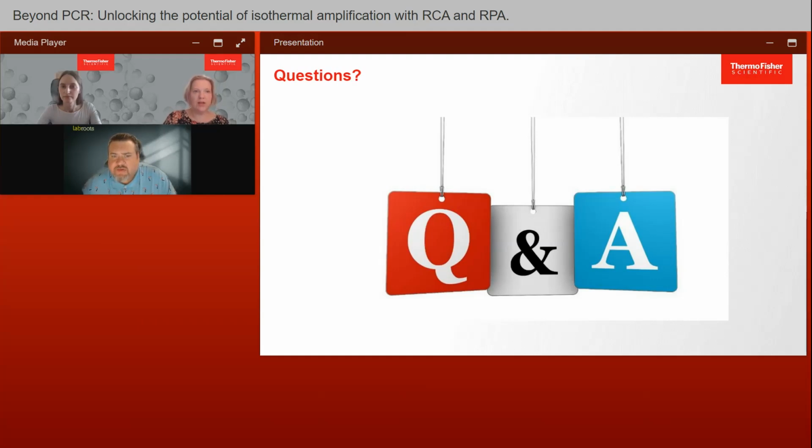In our study, we currently amplified up to 6 amplicons at the same time with RPA, but in general, it's possible to do even more. RPA is a great method for multiplexing because it needs only 2 primers.